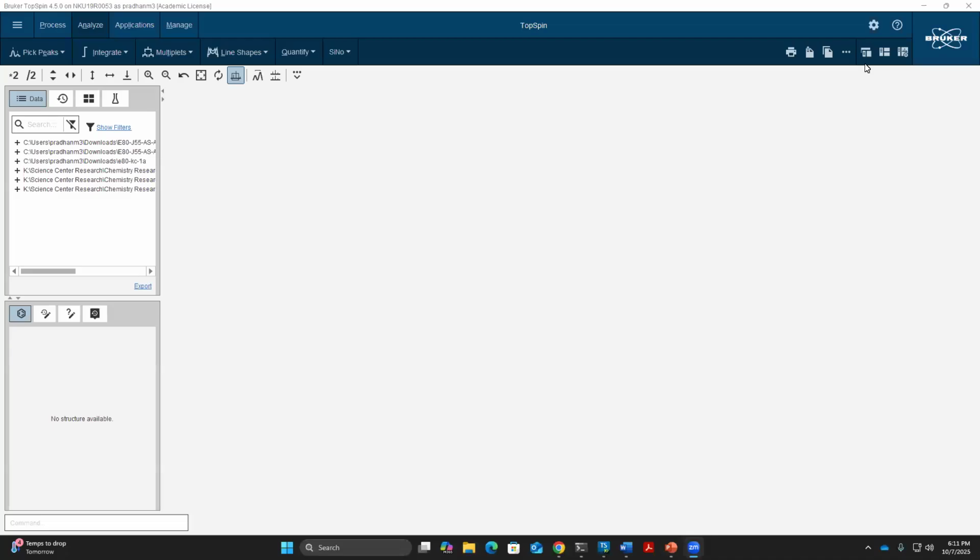Hello everyone, welcome to the second video of the TopSpin software tutorial. In this video, I will show you how to calibrate your NMR, pick peaks, and integrate them.